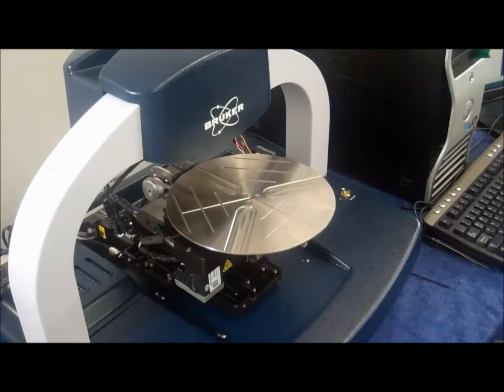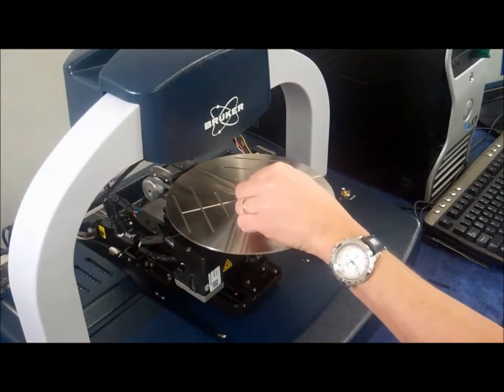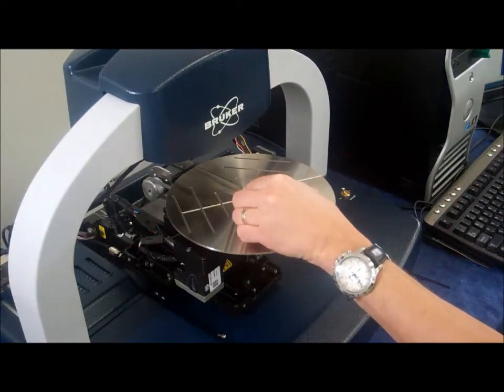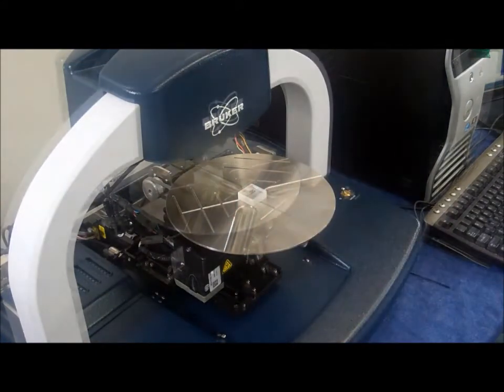There are three basic steps involved in system operation: sample positioning, sample scanning, and sample analysis.